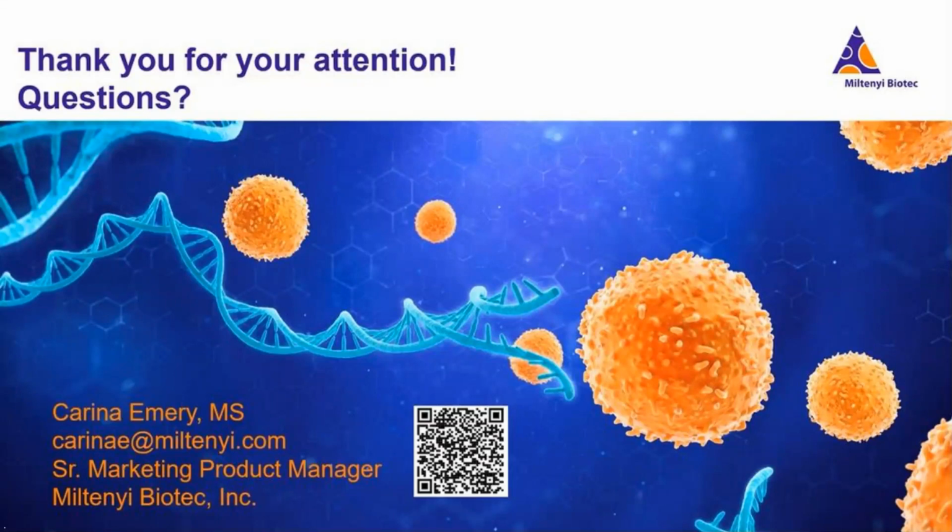I will mention that we don't have a validated dissociation kit or protocol for cold dissociation yet. It is something we're looking into, so it would be something that you'd have to figure out on your own. But the gentleMACS instruments can be operated in a cold room, and we will be releasing cooling units soon, so you don't need a cold room to do the cold dissociation if you wanted to figure out how to do that on your own. And of course, the nuclei extraction needs to be performed cold. So that's what the cooling units would be initially released for.